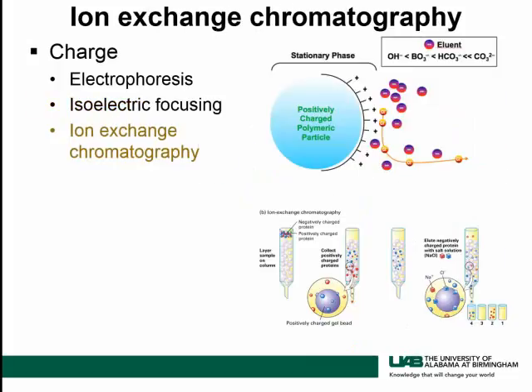And the final one is called ion exchange chromatography. And so you have a crude extract of protein, and the proteins have a variety of net charges on them. Okay, you can set up a column that consists of beads right here that are coated with either positively charged or negatively charged groups right here. This one just happens to be a positively charged group.